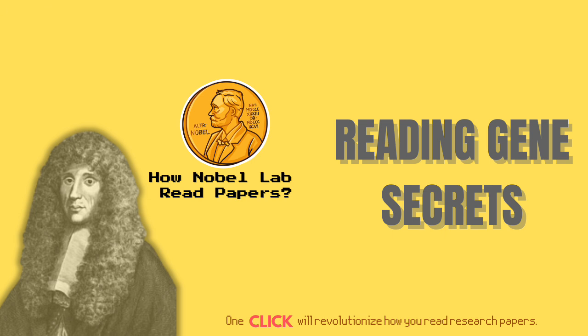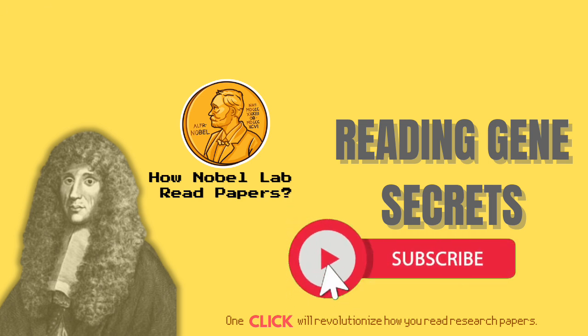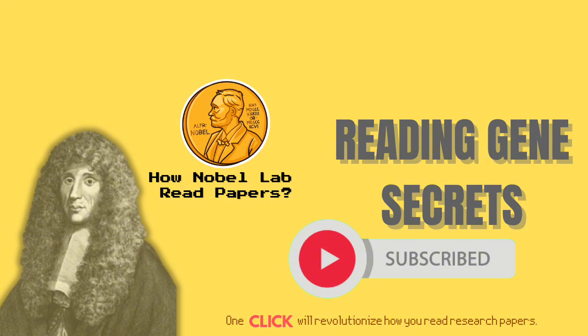We needed something that could ideally capture everything, known and unknown transcripts, quantify them accurately over a massive range, and crucially, reveal all those unannotated splice junctions, the different ways genes can be put together after they're transcribed. That was key. And that splicing complexity, that post-transcriptional stuff, is super important for development, for disease, right? Absolutely vital. But the existing tech was like only seeing the very tip of the iceberg. We knew there was complexity, but we couldn't map it comprehensively. We needed something unbiased, high-resolution, quantitative. That's the massive gap RNA-Seq filled.